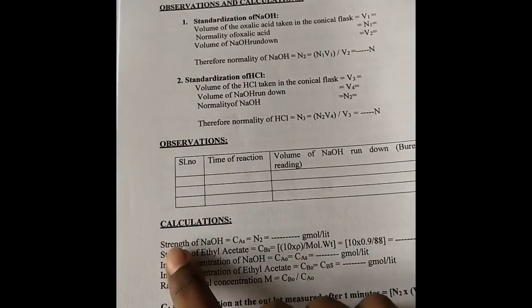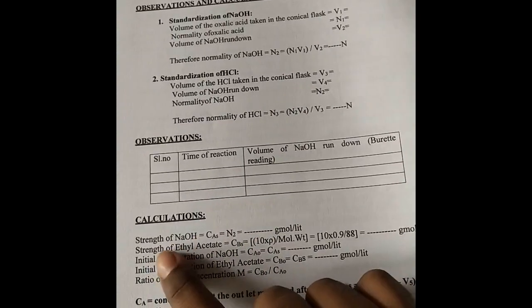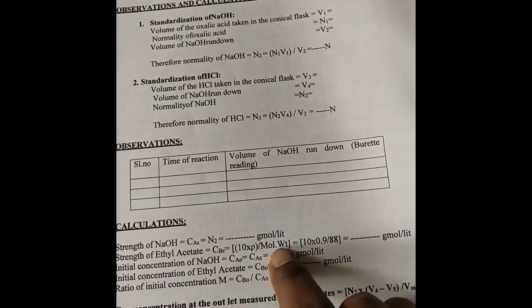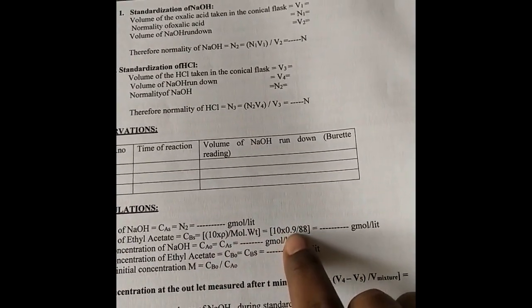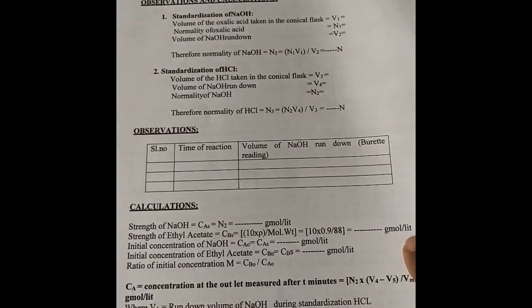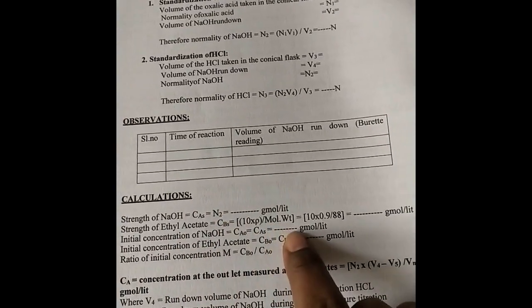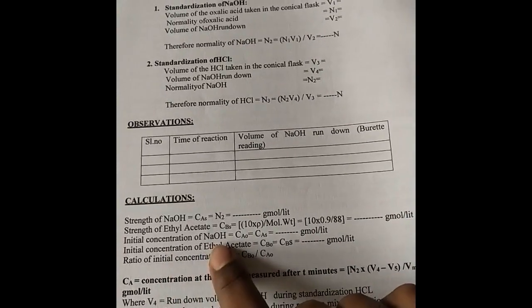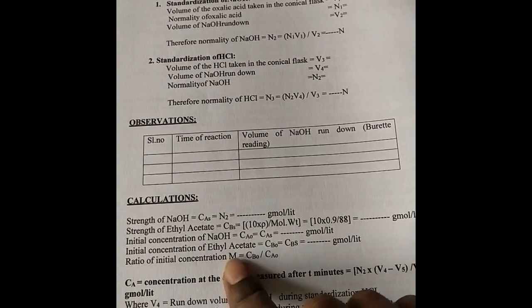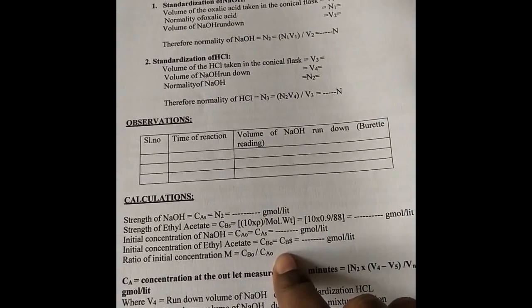So the calculations. First is strength of NaOH, that is N2, which is equal to 0.1 normal. Strength of ethyl acetate is given by 10 into density divided by molecular weight, that is 10 into 0.9 divided by 88. So we get it as 0.1 gram mole per liter. The initial concentration of NaOH is equal to N2, that is 0.1 normal, and that of ethyl acetate is 0.1 normal. Then we have to calculate the ratio of initial concentration Cb0 by Ca0. So we get it as greater than 1.